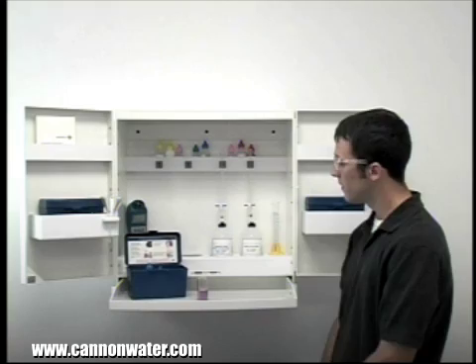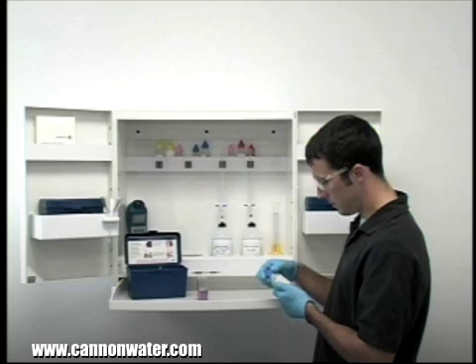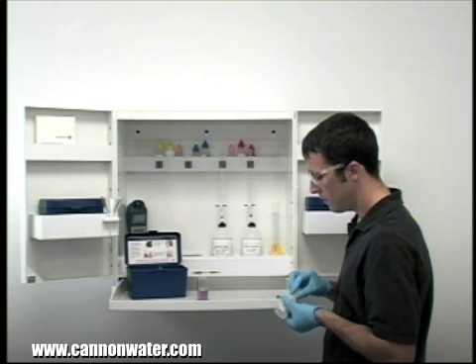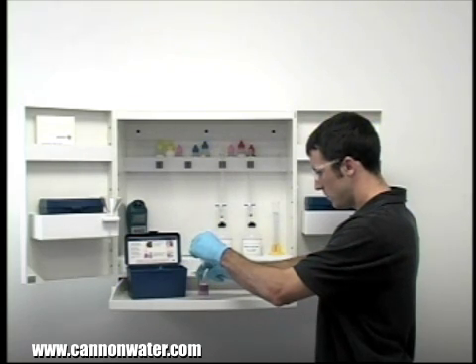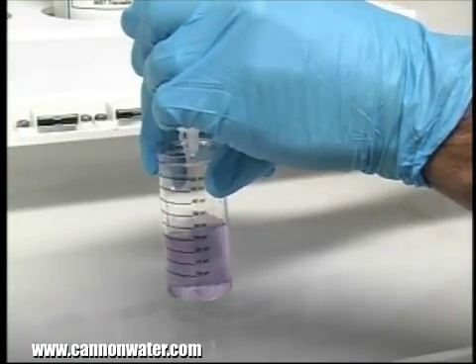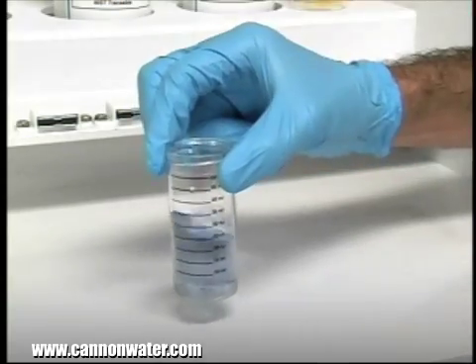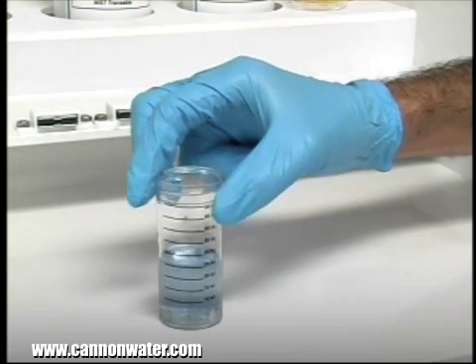The next step according to the endpoint ID procedure is to perform the titration. Each bottle of titrant is labeled with the equivalency and sample size it was manufactured for. It's important to make sure you have the proper titrant and the proper sample size. The bottle of titrant contains a dropper tip, so hold it vertically to ensure a consistent drop size. After the addition of each drop of titrant, swirl the vial to make sure the sample is properly mixed. The titration is complete when the sample changes from red to blue.